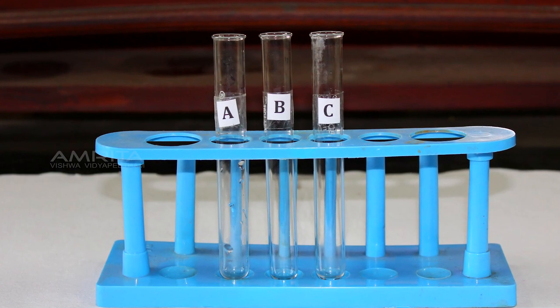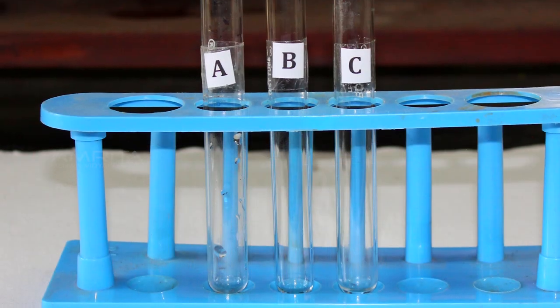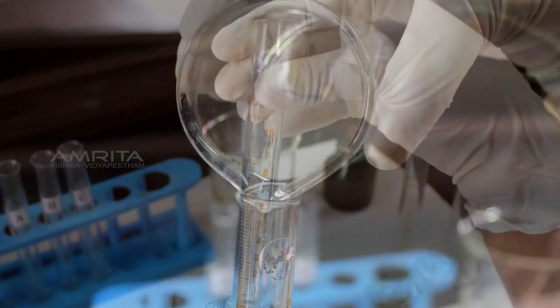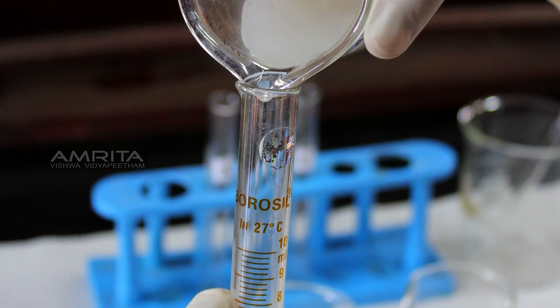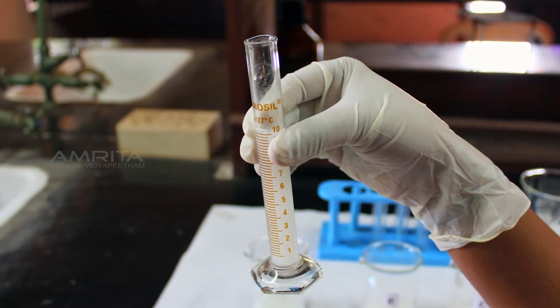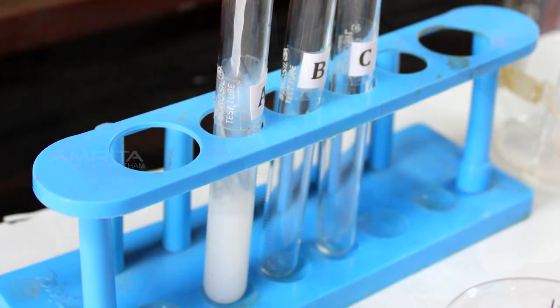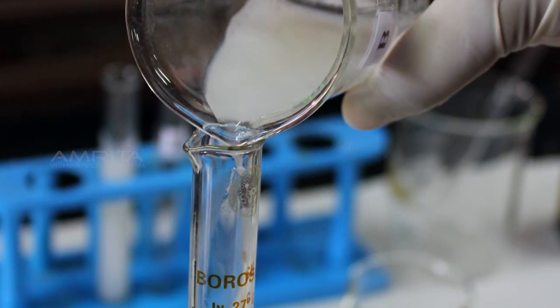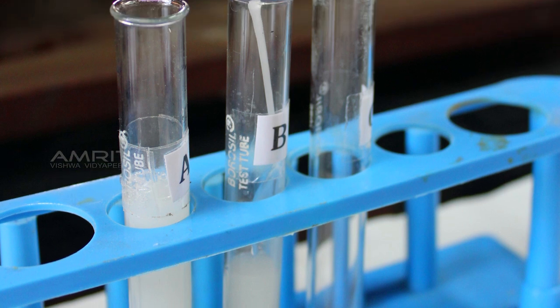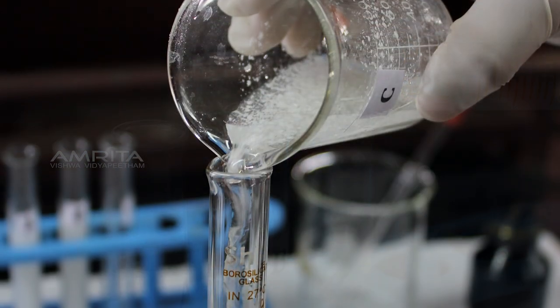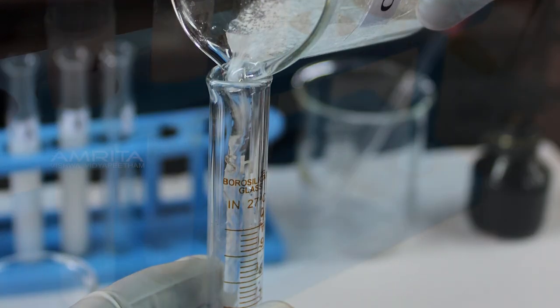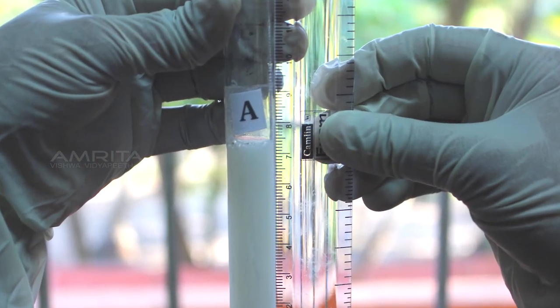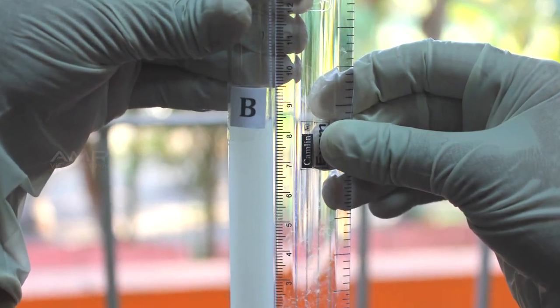Place three test tubes labelled as A, B and C in a test tube rack. Take a measuring jar and pour soap solution from beaker A into the measuring jar and measure 10 ml of soap solution. Pour it into test tube A. Similarly, pour 10 ml of soap solution from beaker B into test tube B and from beaker C into test tube C using separate measuring jars. Measure the initial length of soap solution in each test tube using a measuring scale.